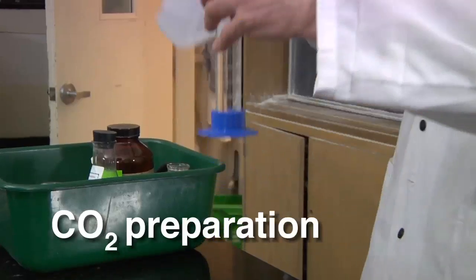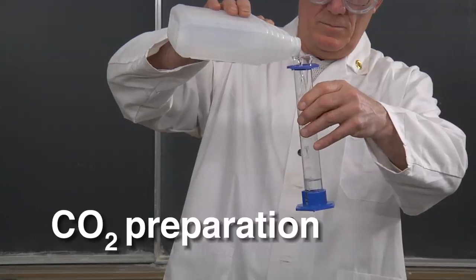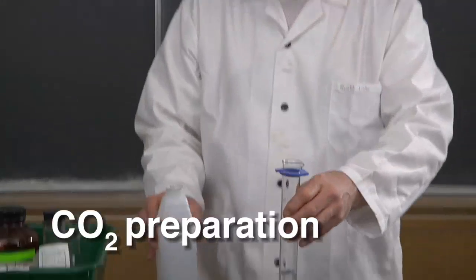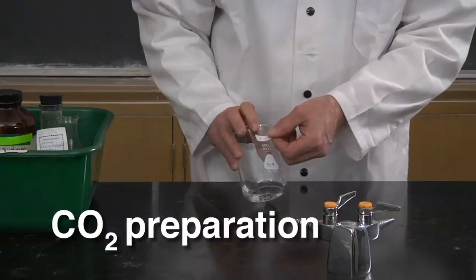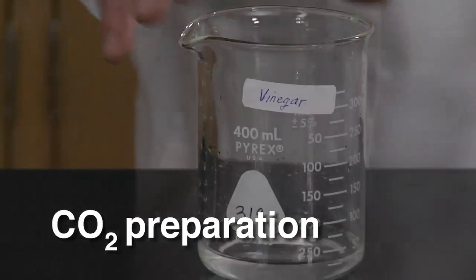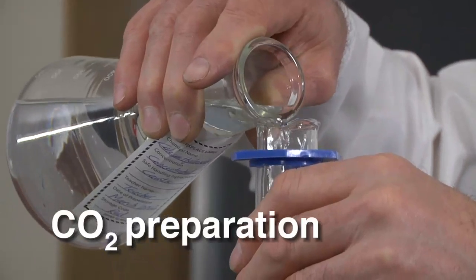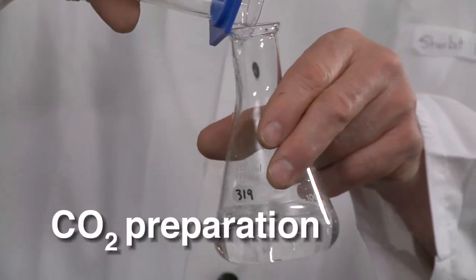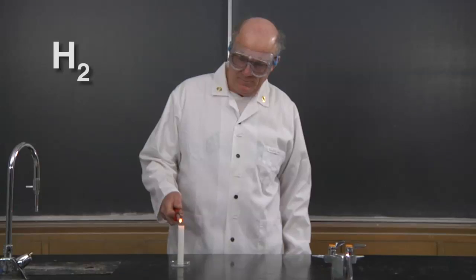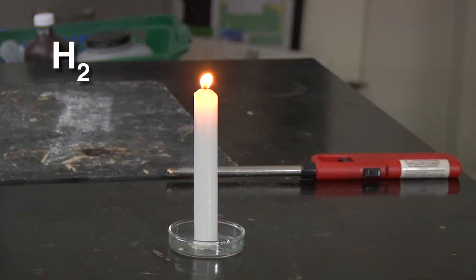Pour 30 milliliters of white vinegar into a graduated cylinder and then into the empty 400 milliliter beaker. You should always ensure that the rubber guard on the graduated cylinder is properly positioned to protect against breakage. Pour about 75 milliliters of lime water into a graduated cylinder and then into a 250 milliliter Erlenmeyer flask. Prepare the flame for the tests. Use a candle with a barbecue lighter.